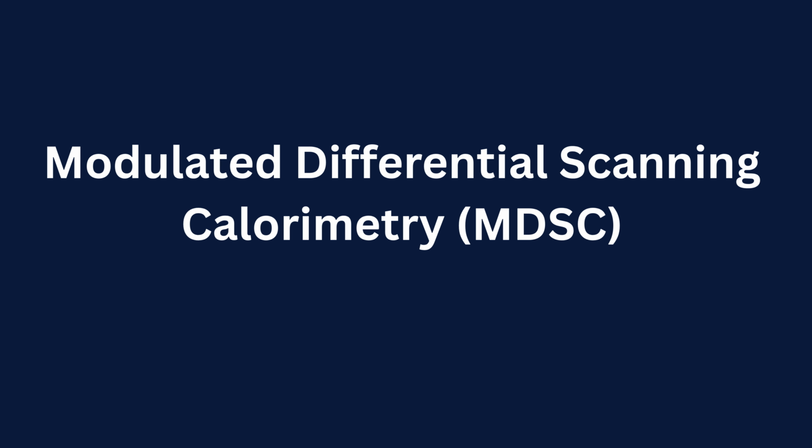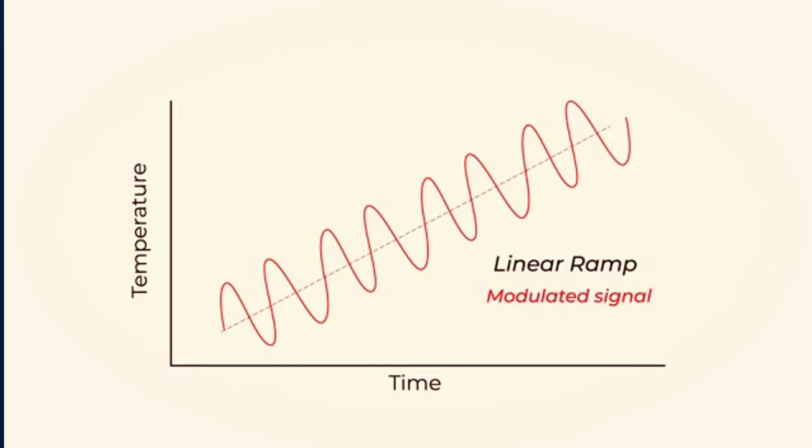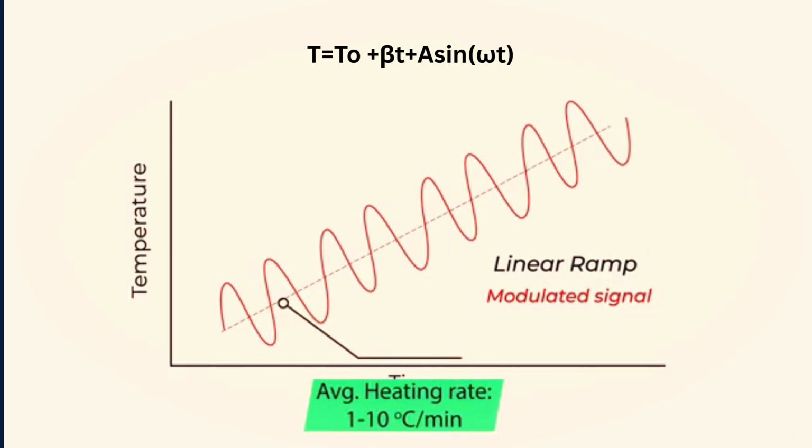Modulated Differential Scanning Calorimetry, MDSC. Modulated Differential Scanning Calorimetry, MDSC, is an advanced DSC technique that superimposes a small sinusoidal temperature oscillation onto the conventional linear heating program.